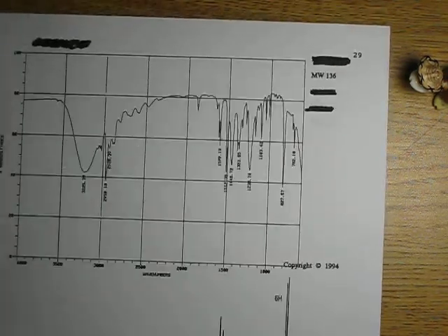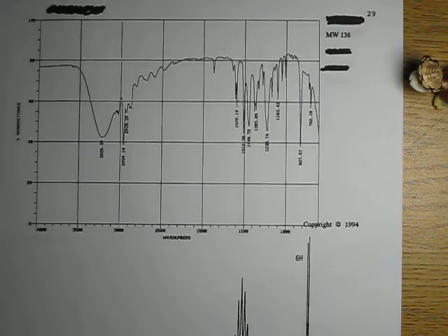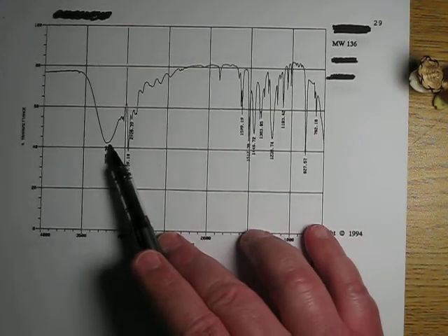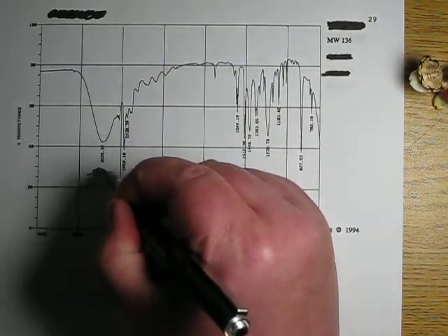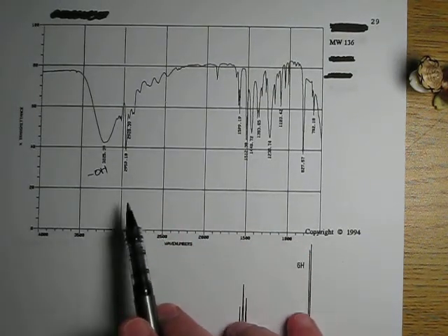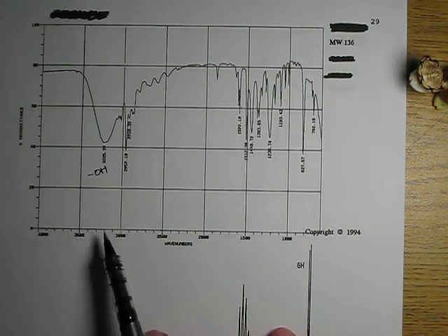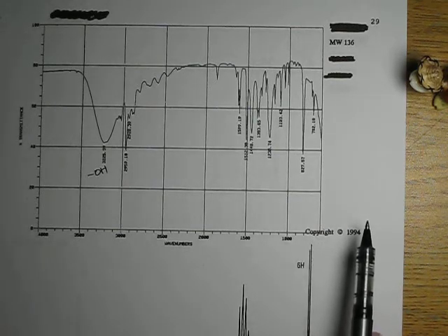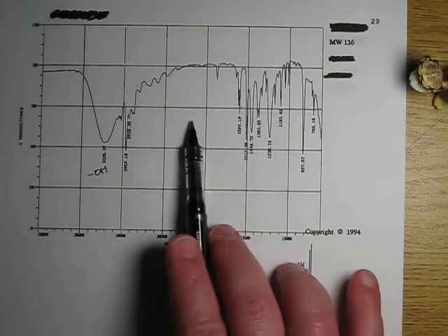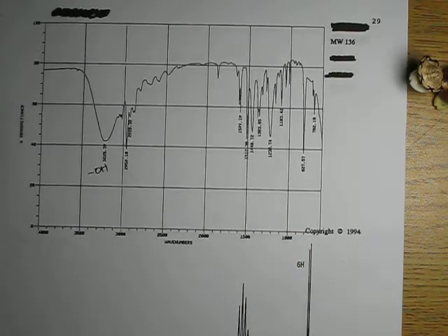Let's grind through them. Okay. So let's look at this beast here. A molar mass, molecular weight of 136. Ooh, the IR is looking happy, because what does this tell me? That's an OH. I know I have an OH in here. All right. The IR is also telling me I've got some junk in here slightly to the left of 3000 wave numbers. And so I'm betting there's double bonds and stuff in here, but I know I have that OH. Note, no carbonyls. There's no carbonyls in here, so I don't have to worry about those.